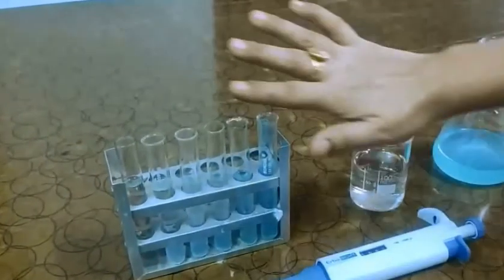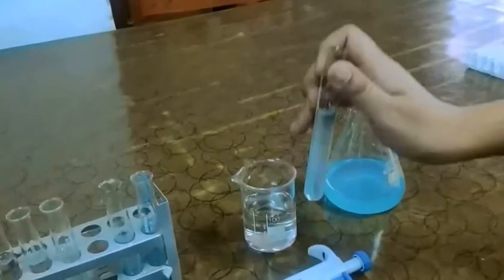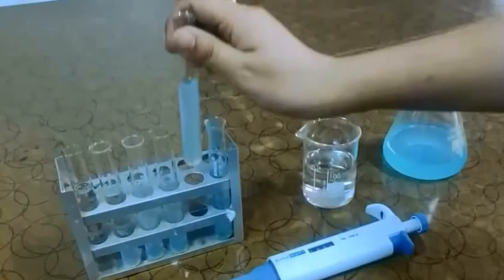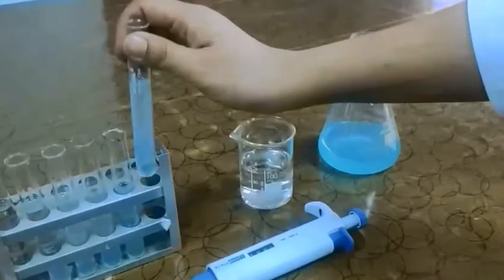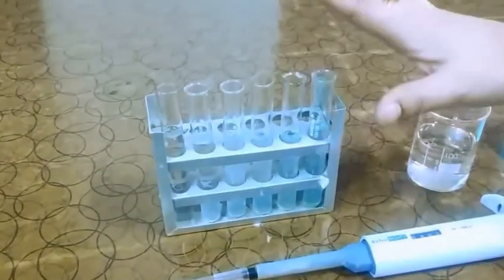And then for the third test tube, 3 ml of stock solution and 7 ml of distilled water. Likewise for the fourth, 4 ml of stock with 6 ml of distilled water, and then 5 ml each of stock and distilled water for the fifth test tube. I'm going to measure this in optical density.